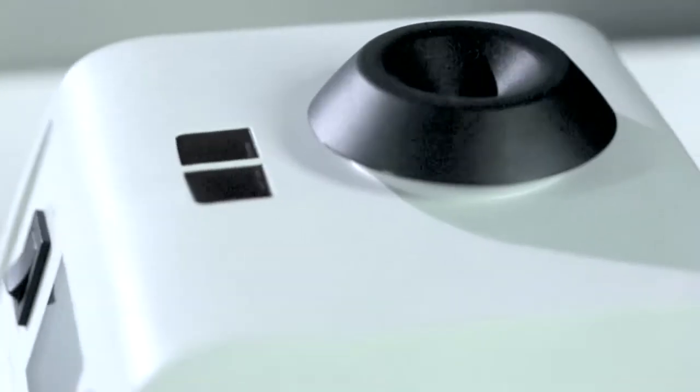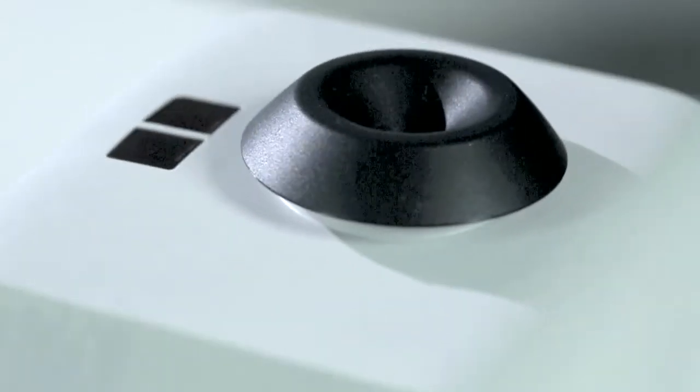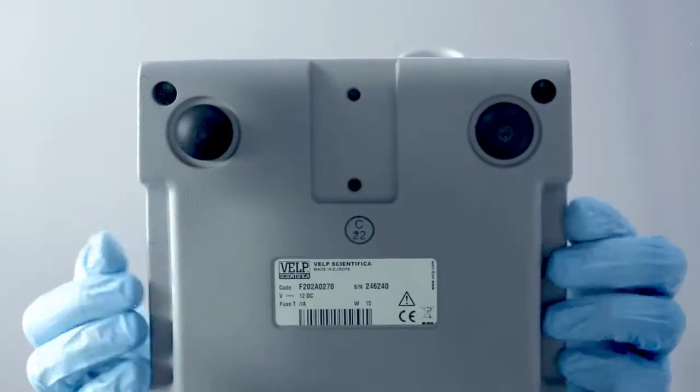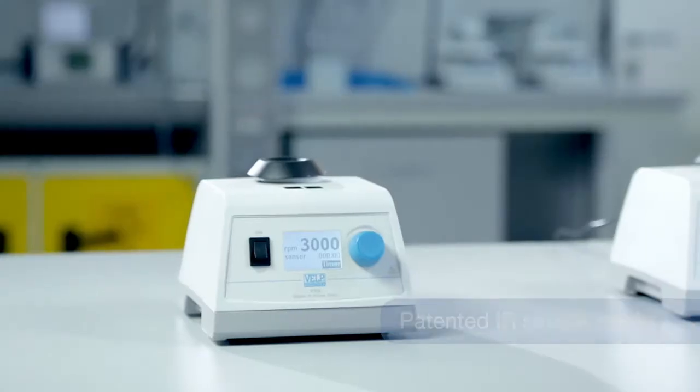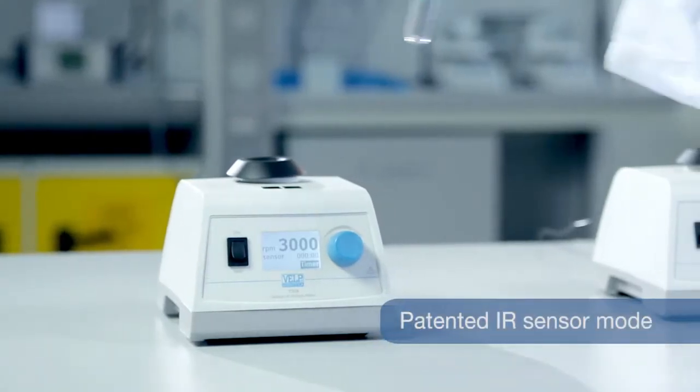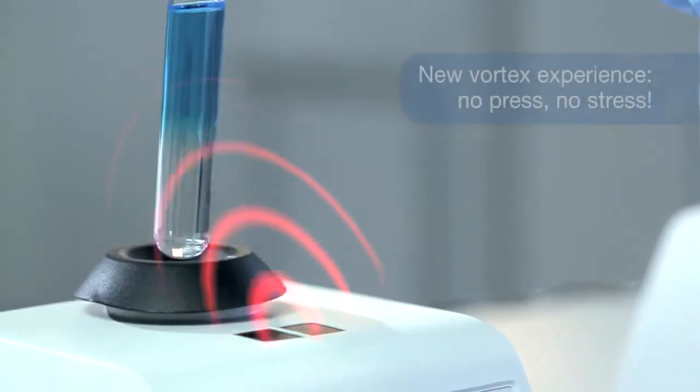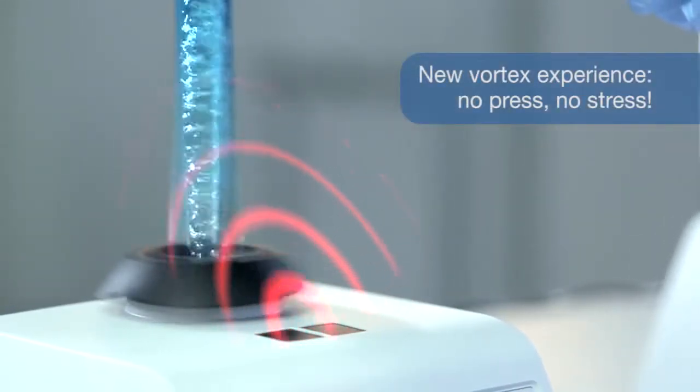Our Vortex mixers have been designed to be very powerful, very stable, and really easy to use. The patented IR sensor provides a completely different experience to that which you have ever had in the past.